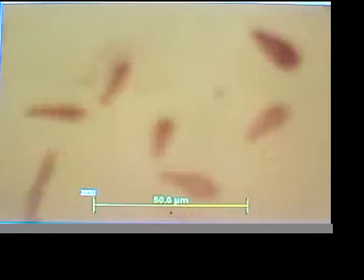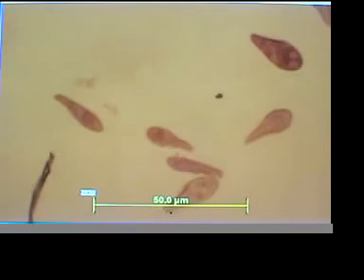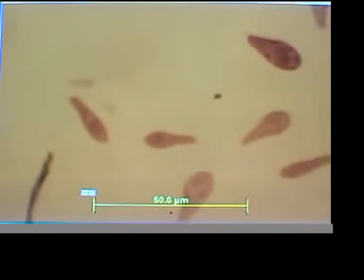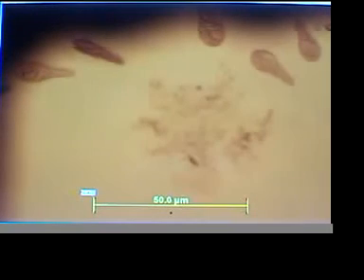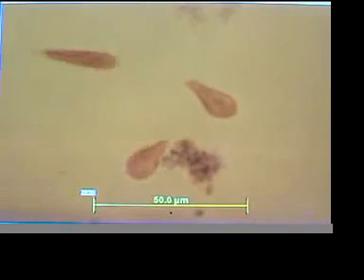So again, just trying to give you a sense of what's happening on the grid. 8 and 9 here. You're seeing now 8. There's 9. We'll focus a little bit. See, they're very slow or stopped. That's 9B. 9C has a number of guys up near the box, the top of the box, very slow. 8C. 8D, some very slow guys here. There's 8D. See there. Yeah, they are moving.